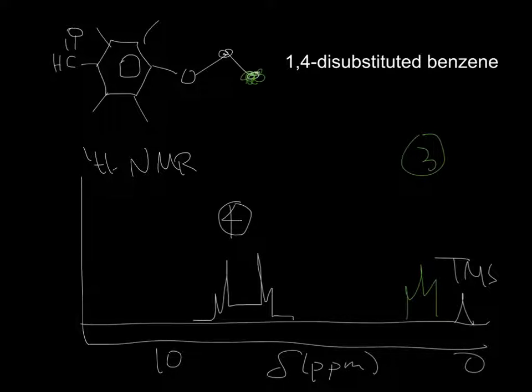In fact, if you remember, aldehydes and carboxylic acids are way down there. So it's going to be in here. It's this one. The peak for that one is going to integrate to what number? To 2, because there are 2 of them. So I'm just going to put it here. Once again, this is not drawn to scale.